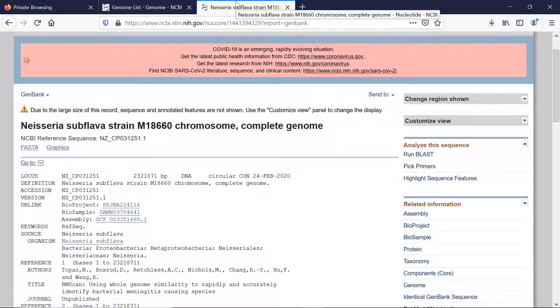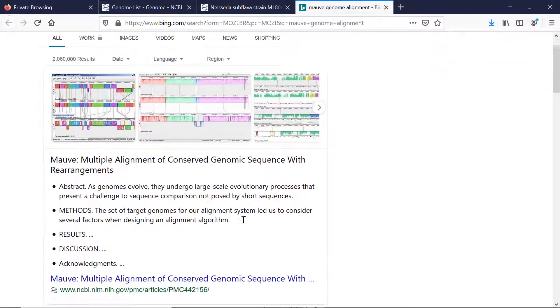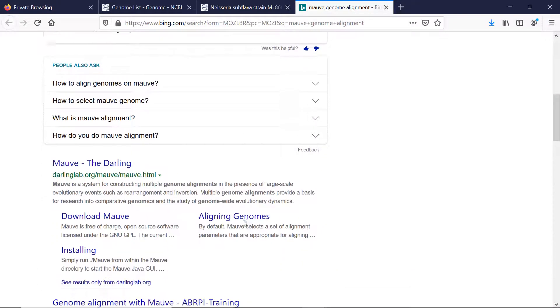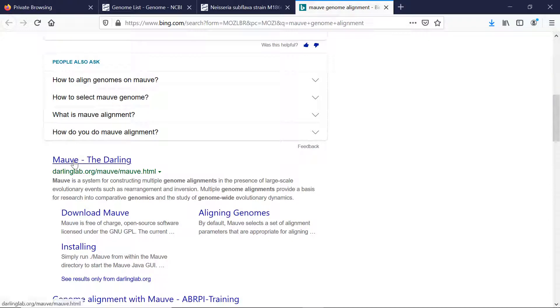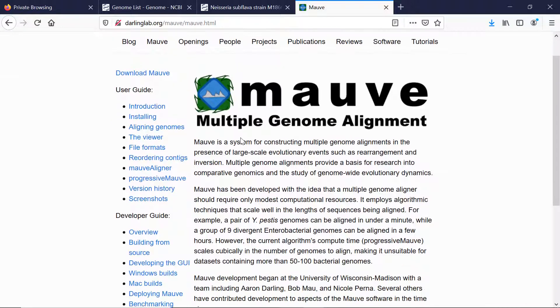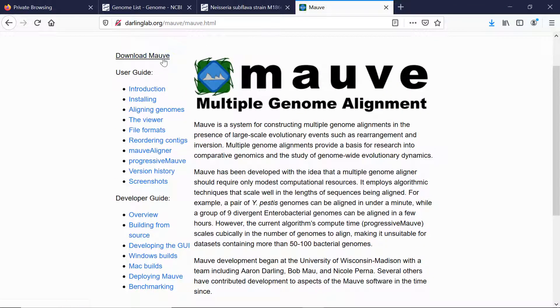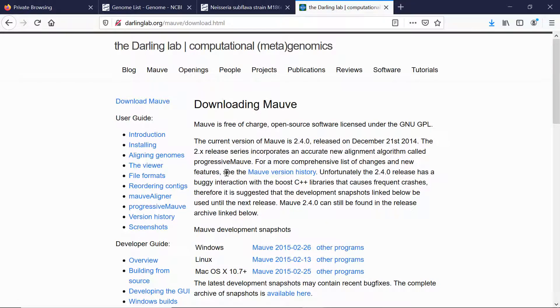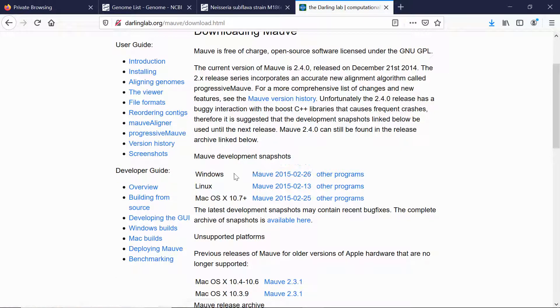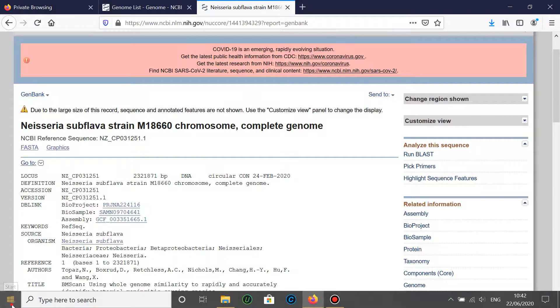You'll then need to access Mauve. If you don't know where it is, you can type in 'Mauve genome alignment'. Look down and you'll find the Darling Lab — that's Mauve from the Darling Lab. If you want to download it, select 'Download Mauve' and then select the version suitable for you. I've got a version suitable for Windows which I've already downloaded, so I'll open up Mauve.